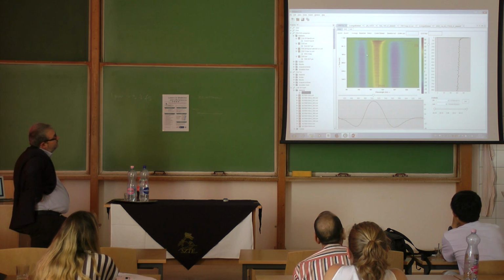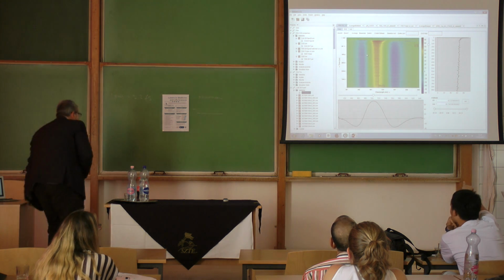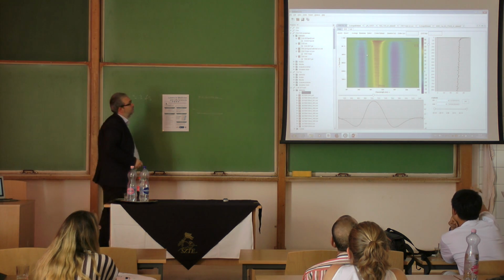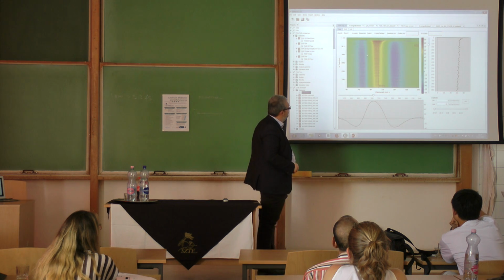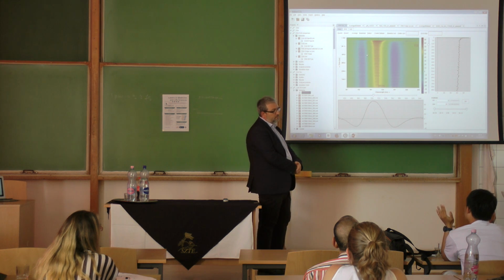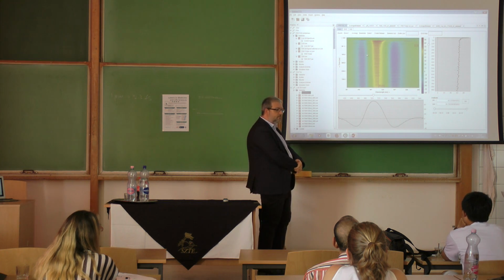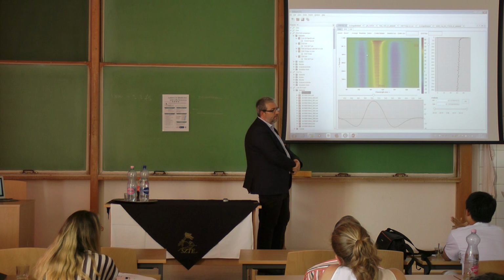Okay, so the right side is to choose the time. And the lower side is to choose the wavelengths. So the ultrafast pulse contains many wavelengths. It's somehow like a time-frequency domain graphic, because wavelengths can be transferred. Yeah, you can do that.